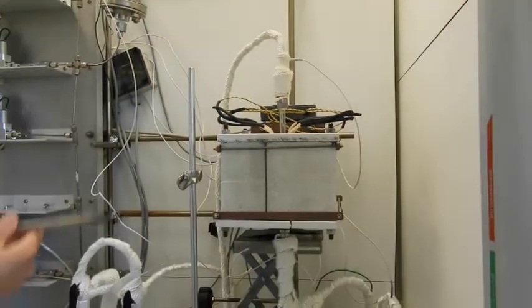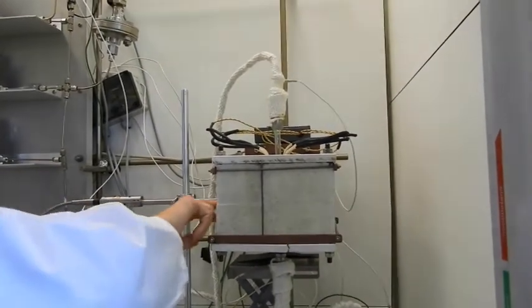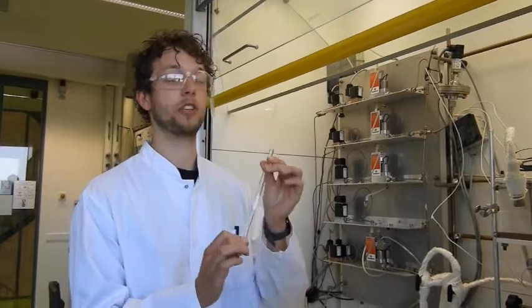So actually I'm doing something that is complementary to what Florian is doing. So in this setup we can use Raman spectroscopy, which is also a vibrational spectroscopy technique, but now to study the catalyst instead of the catalyst surface. So what we can do is we can look at the vibrations of the catalyst itself, and we can observe, let's say, phase changes that occur during the reaction. So for instance, in the reaction that I'm doing, I'm using hydrogen chloride, and this affects the state of my catalyst. I have a lanthanum oxychloride catalyst in this reactor, and if we react it with HCl, we can see a phase transition from the lanthanum oxychloride to the lanthanum chloride. And that is something that we can observe with the Raman spectroscopy.